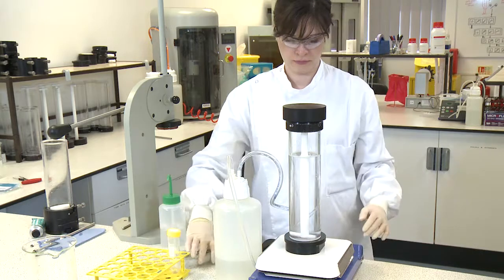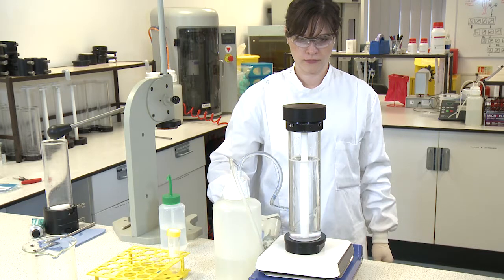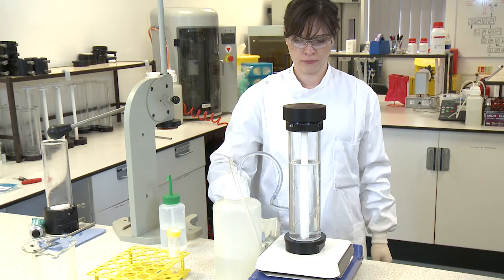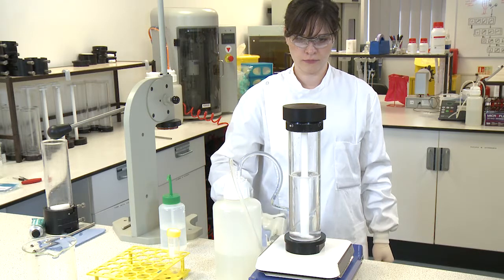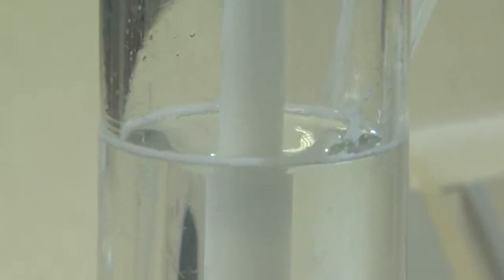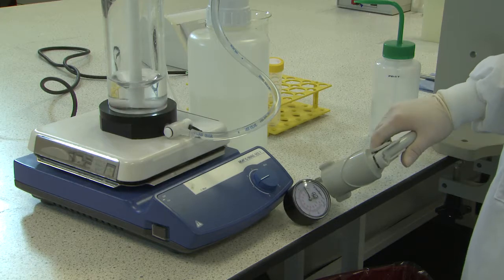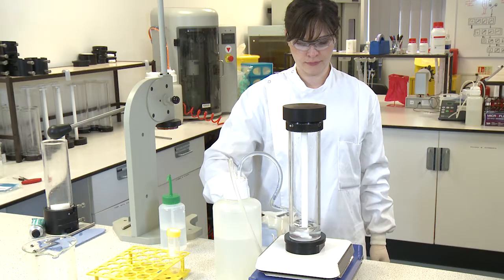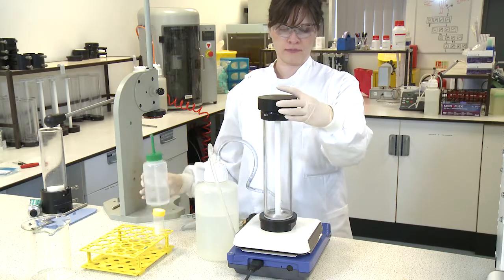Open the tap and carefully reduce the volume of the eluate to approximately 30 millilitres. Use the hand pump to gain vacuum of no more than 30 centimetres of mercury. Note that not all of the sample eluate should be drained away, as oocysts and cysts will be suspended in the liquid above the membrane. Close the tap on the concentrator base.